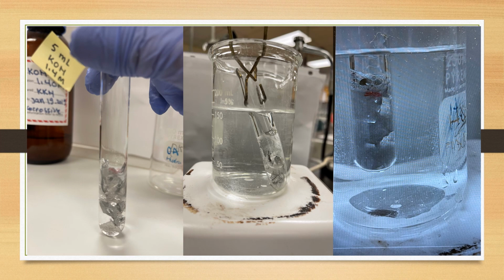Set up a hot water bath using a 250 ml beaker. The water should be hot but not boiling. Then dispense 5 ml of 1.4 molar potassium hydroxide into the test tube to dissolve the pieces of the aluminum foil. Mark the level of the solution and place the test tube into the hot water bath.